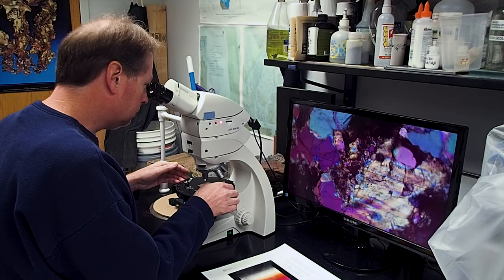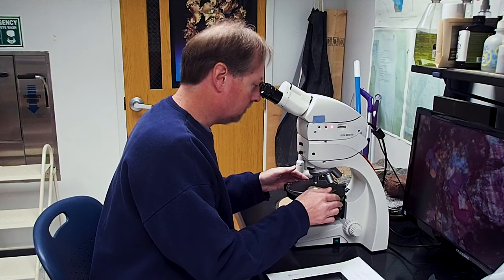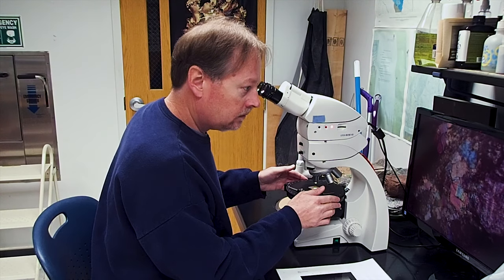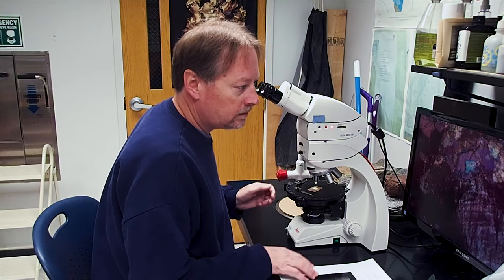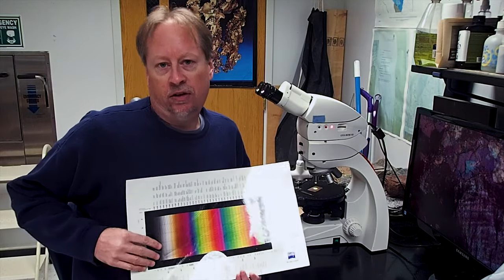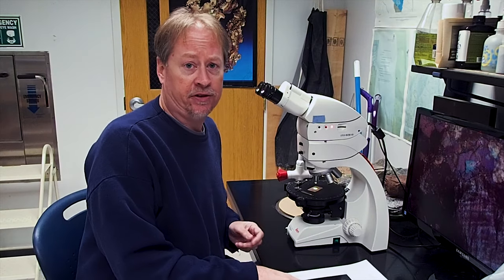If you can't confidently identify any minerals, your sample is still too thick and you will need to continue grinding it down. However, if you can identify any minerals in the section, you are getting close and will continue slowly grinding, checking the sample until those minerals achieve the correct maximum interference color. Here at NOVA, we keep a laminated Michel-Lévy color chart on hand to use as a guide when checking our samples beneath the microscope.